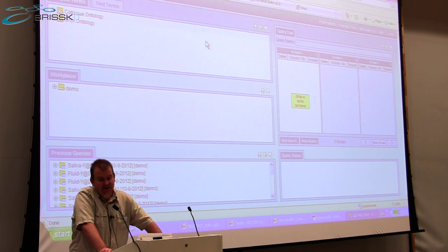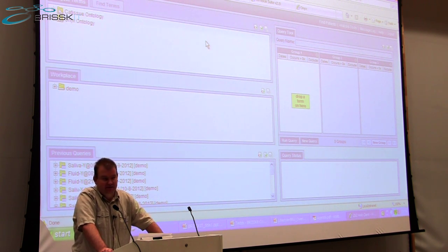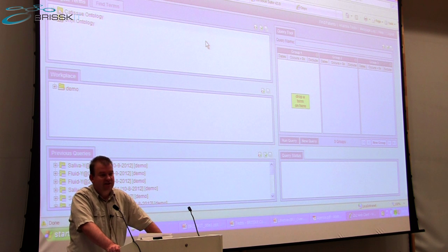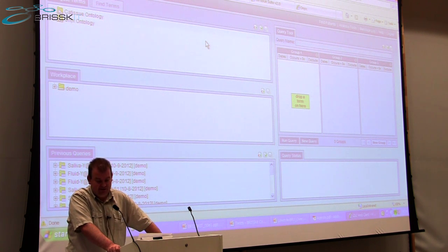What I want you to imagine now is that the process you've just seen of recruitment and data generation through interview tool and CA tissue has all happened several thousand times to build up a population of willing subjects.